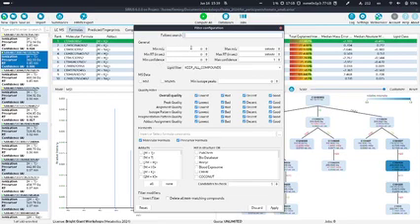Just as a quick example, I want to show you how to filter by MZ, by mass ranges. So just for this example, let's say we want all the features which have a minimum MZ of 300 and a maximum MZ of 350. And we also do a little bit of filtering on the retention time and say we only want compounds with a retention time greater than 5 minutes. Just to let you know, here we are required to enter the retention time in seconds, not in minutes. Otherwise we will just leave everything as is.